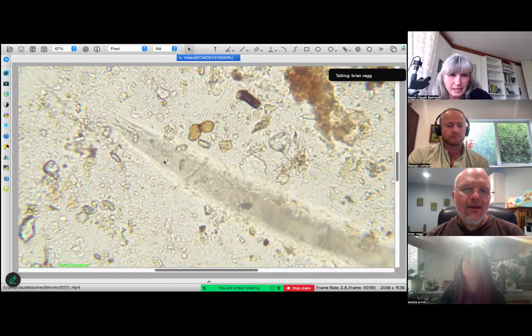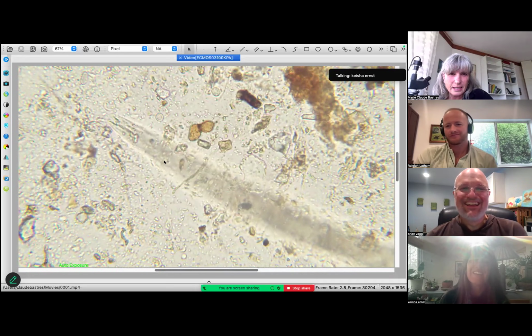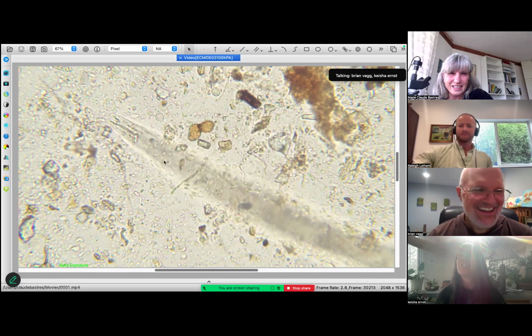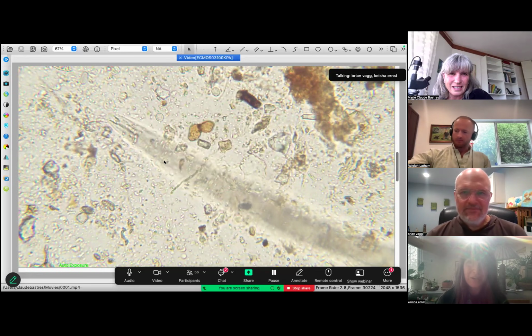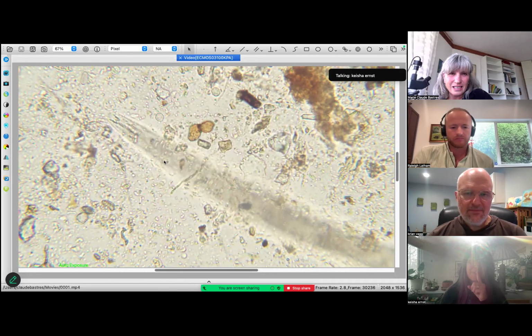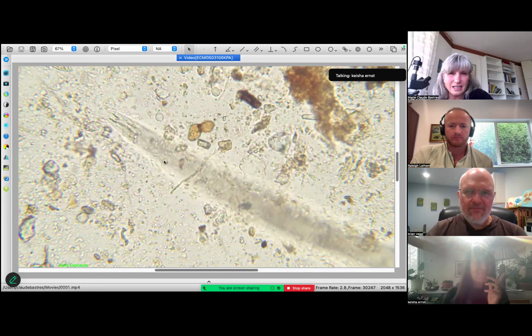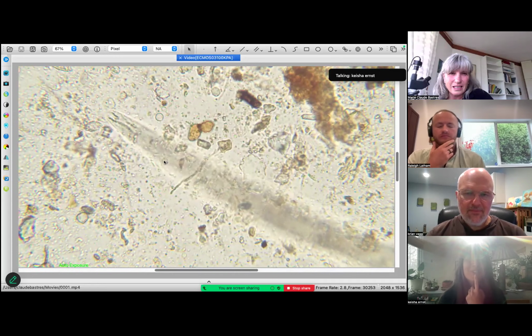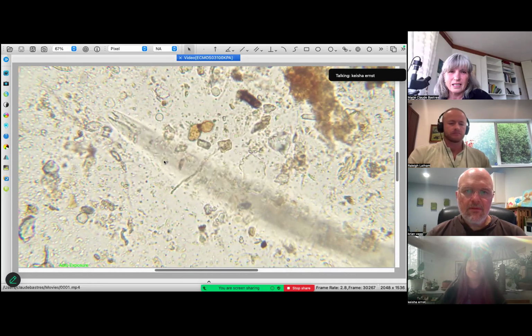I mean, that's the truth with nematodes: the deeper you go down that rabbit hole, there is no very strict defining characteristic of who eats who. Predatory nematodes don't necessarily have a tooth. Sometimes they have a spear. It's interesting when you actually see them eating each other, you can see different mouth parts eat different things.